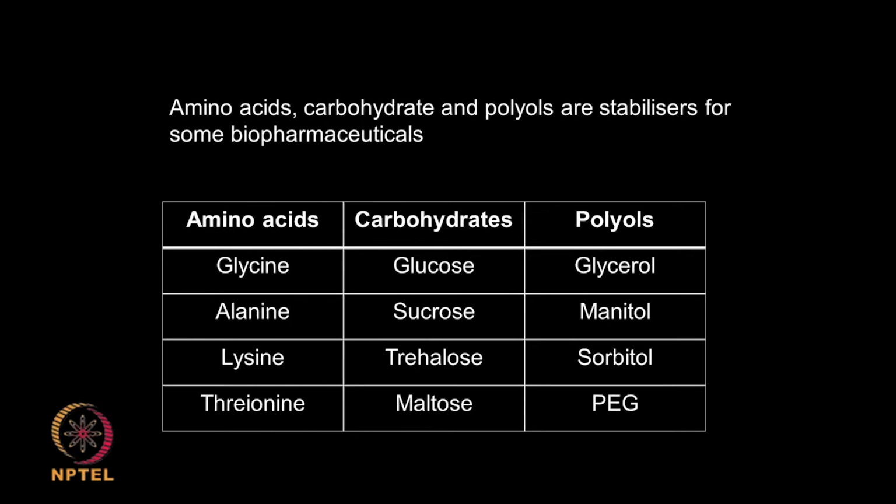So, today we talked about a mixture of downstream activities. Generally these downstream activities are resorted to at the end of the operation, that means at the end of the purified product stage, where I either want to make the product into a solid and dry it using temperature, or lyophilize it at low temperature, so that I end up with a solid product.